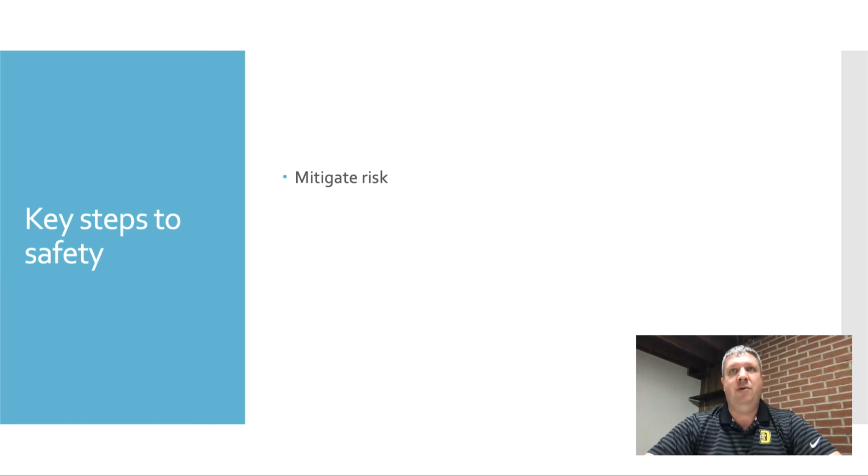All of the things that we are doing at BTA right now related to COVID are about mitigating exposure, meaning we can't 100% guarantee that there's not going to be any exposure to COVID or the flu or the cold or cooties at BTA, but we want to try and reduce that risk as much as is possible or practical or whatever standard we happen to set for reducing the risk. So the word mitigate means to reduce the effects of. So we want to reduce the effects of any potential risks that we may face in the chemistry lab.